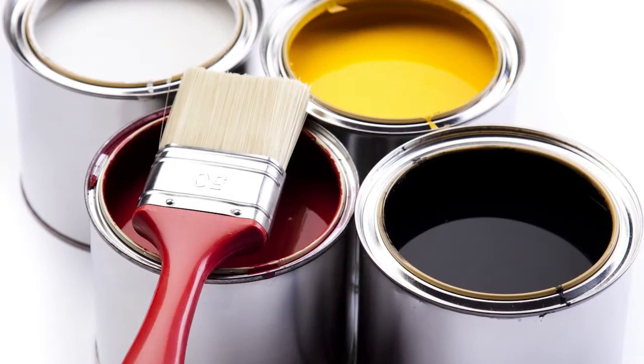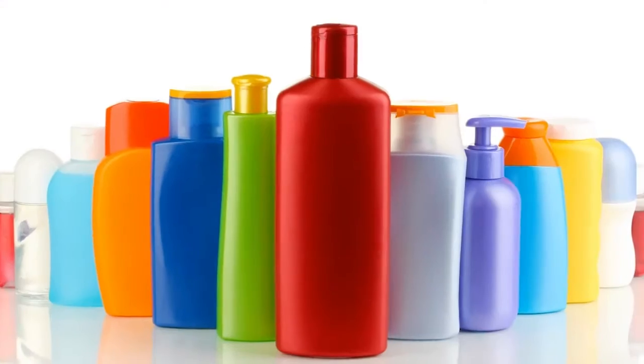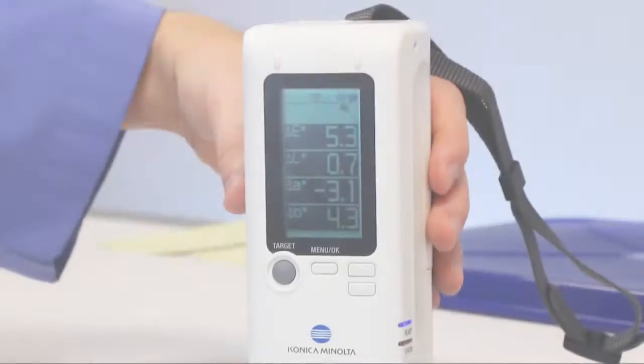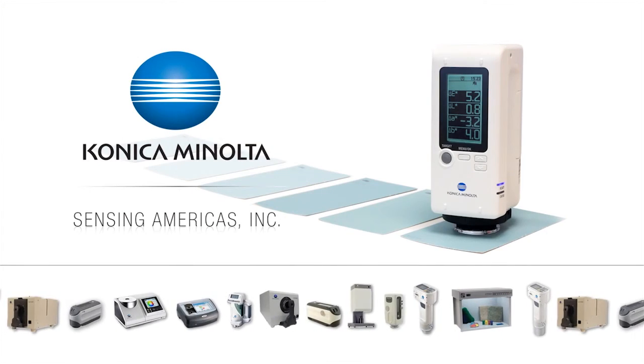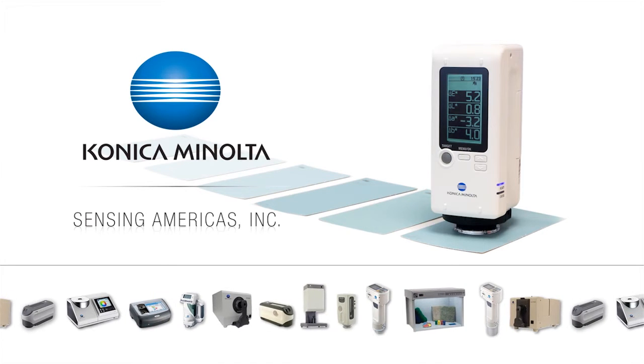Products and materials with inconsistent color negatively affect consumer perception and product quality. To meet this challenge, Konica Minolta Sensing, the leading manufacturer of color measurement instruments, offers the new CR10 Plus Color Reader.